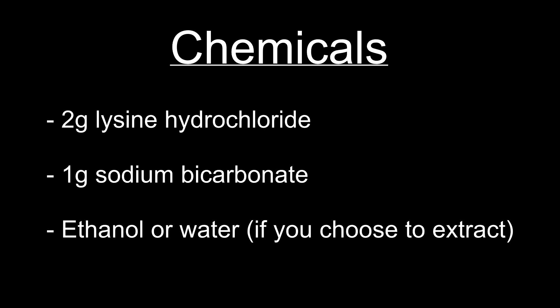For this experiment, the amount of chemicals that you use will depend entirely on how much cadaverine you want to make. Also, the amount of chemicals that I used was somewhat arbitrary.